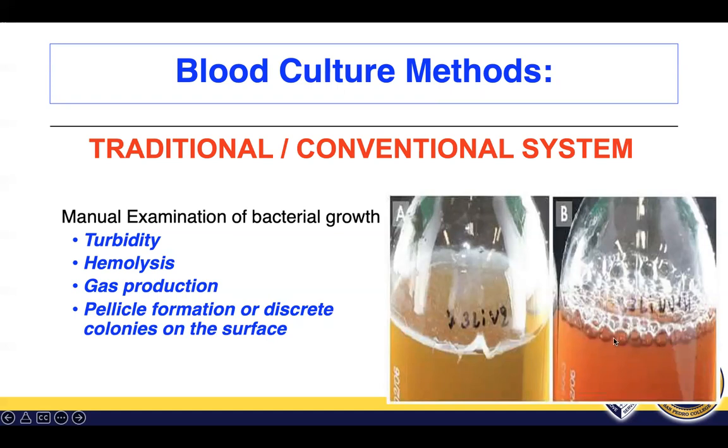Gas production is another sign, like the bubbles here. And then pellicle formation. Pellicle is similar to a colony, but on liquid media. So this is pellicle formation, and it can be found on the surface of the broth.